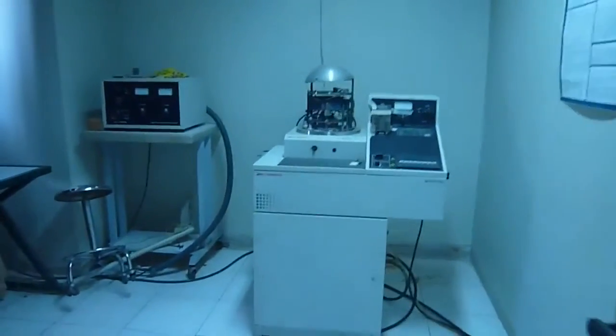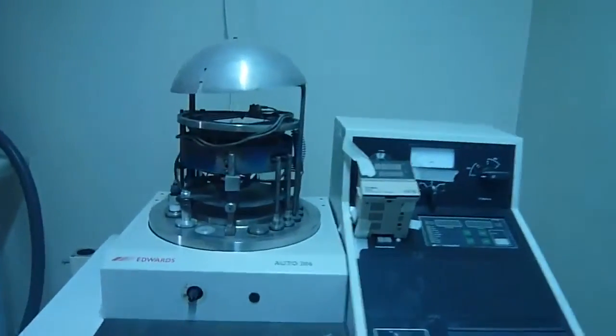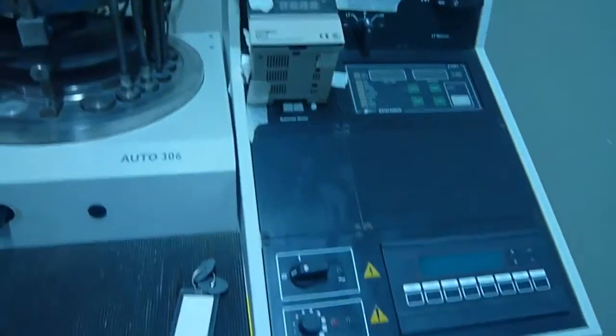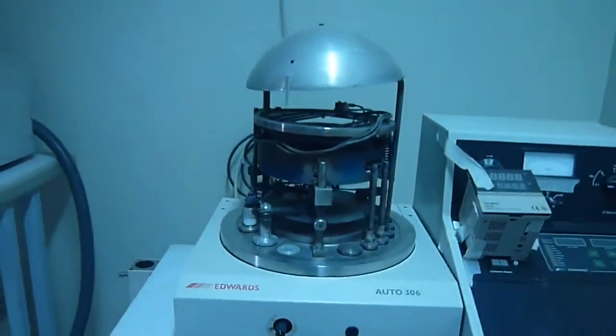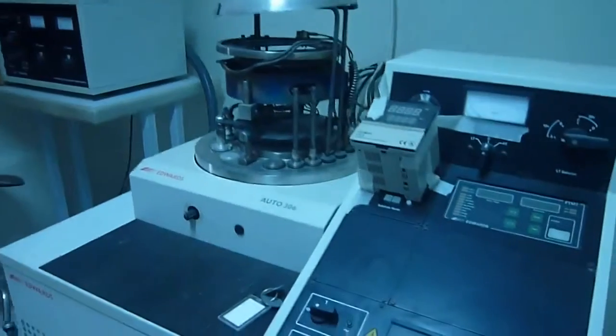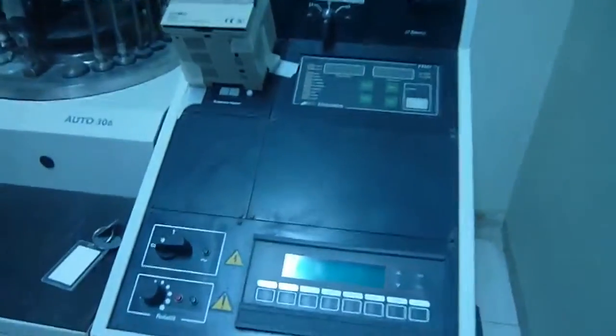This is the physical vapor deposition equipment in our laboratory. Physical vapor deposition, or PVD, describes a variety of vacuum deposition methods which can be used to produce thin films. PVD uses physical processes such as heating or sputtering to produce a vapor of material which is then deposited on the object which requires coating.